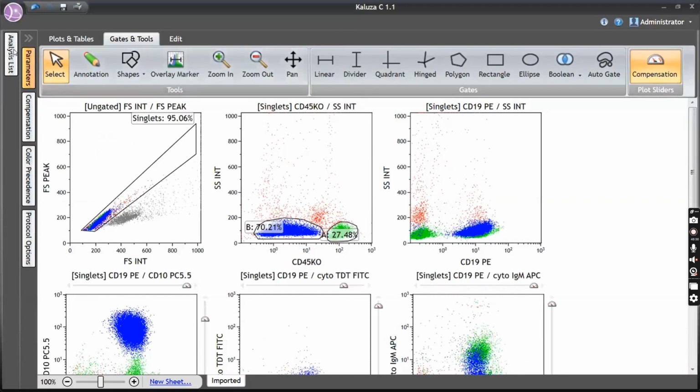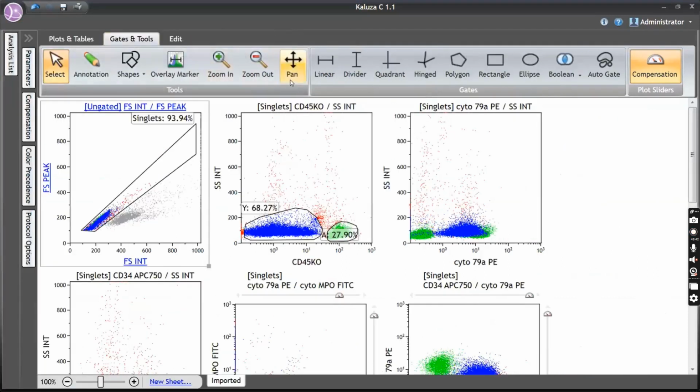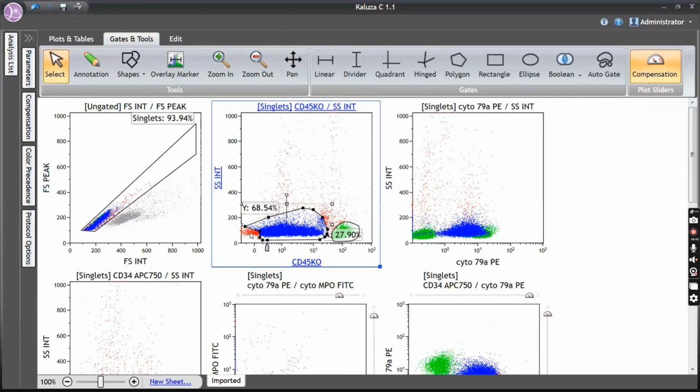But the myeloid tube is very important, more than those two, right? Okay, so let's go with the myeloid lineage tube. Any doubts? If you have any doubts, you can unmute and ask your questions. So this is the lineage tube.